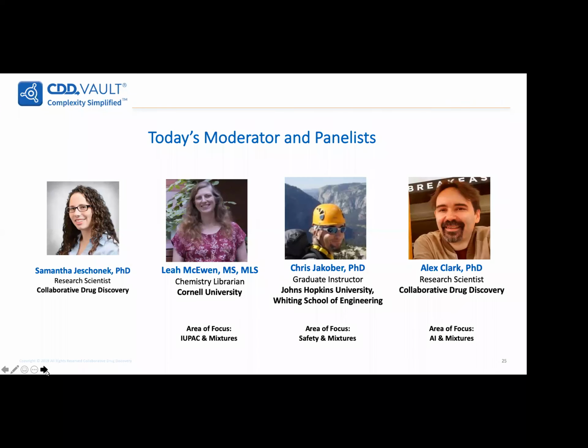All right, thank you. So all of the panelists at some point today have mentioned how MInChI and the description of mixtures may relate and be expandable into the world of formulation. So we had a question specific to that. One definition of a formulation is that it is a mixture where the components have a role. They're there for a reason. Can this reason be modeled as well in some standard representations, such as the MInChI?